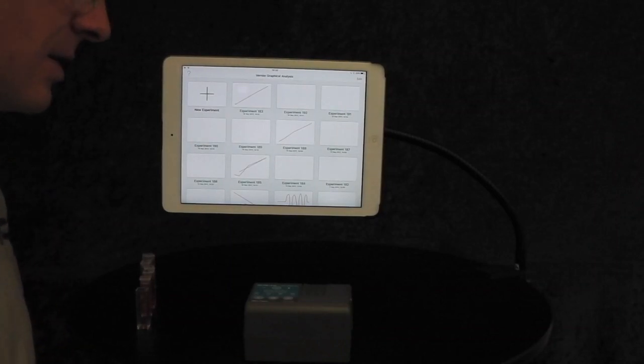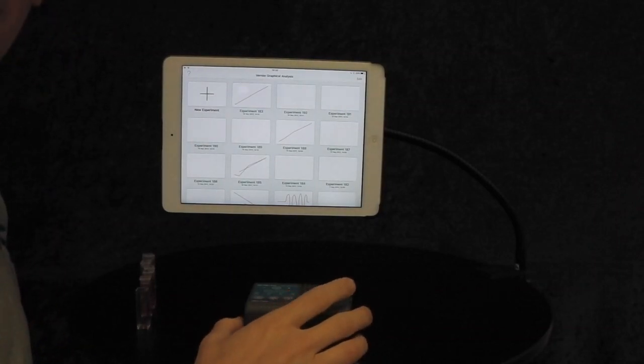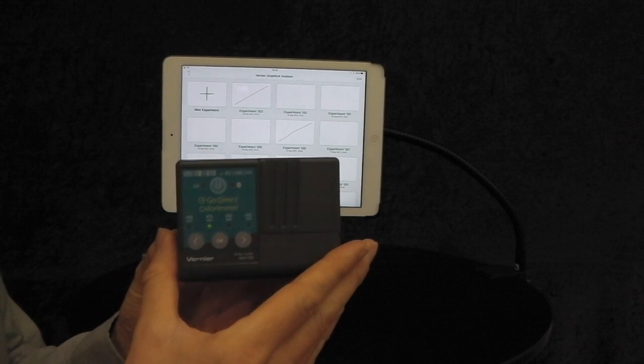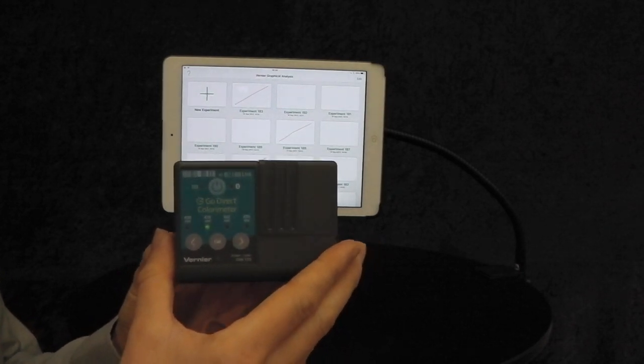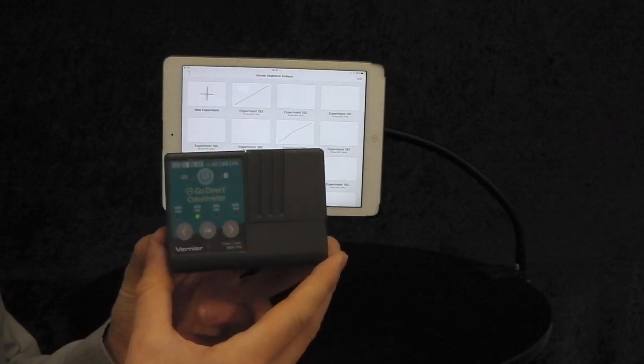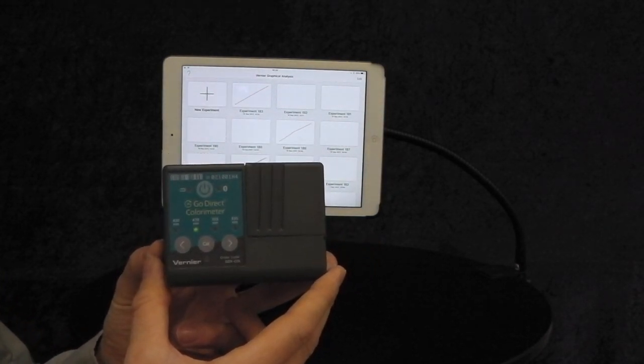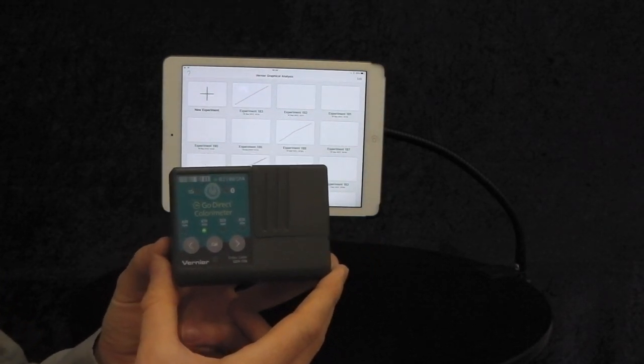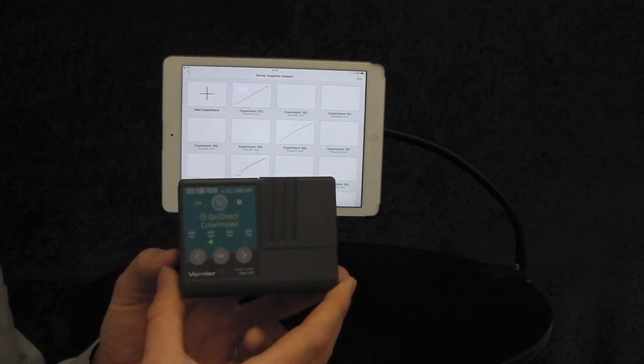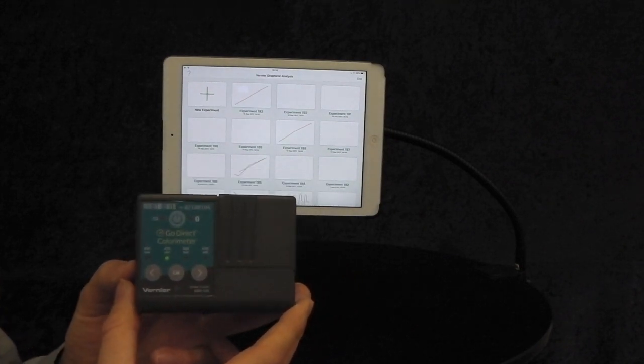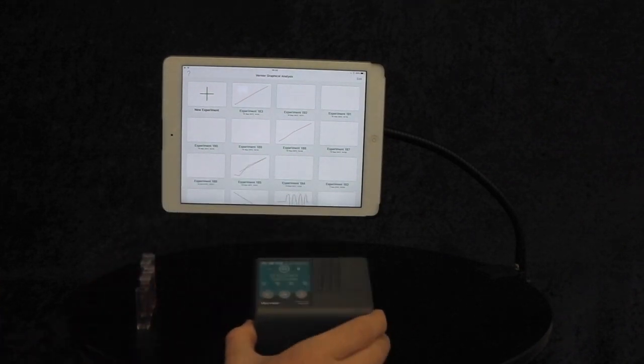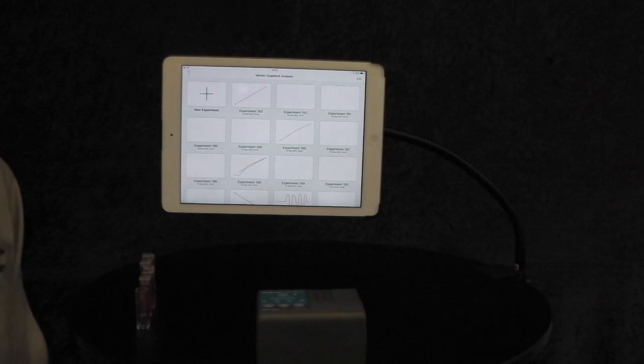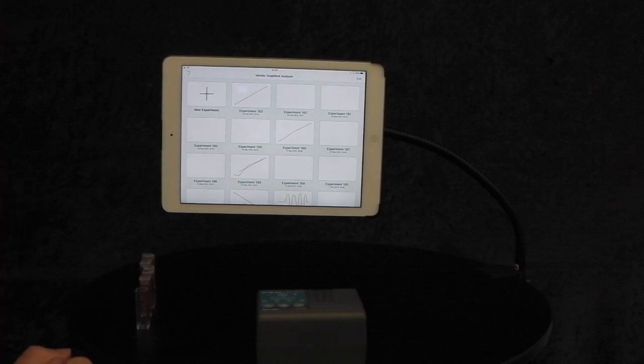Hi, it's Dan from IDS. I'm just starting to give you a quick video on our new GoDirect Colorimeter. It's both Bluetooth and USB, so it can be used with an iPad, Android device, PC, Mac, or Chromebook. It utilizes the free Graphic Analysis 4 app, which goes on all devices.